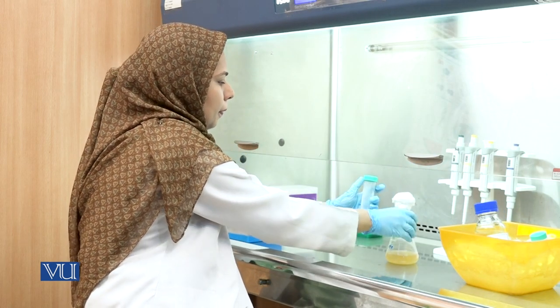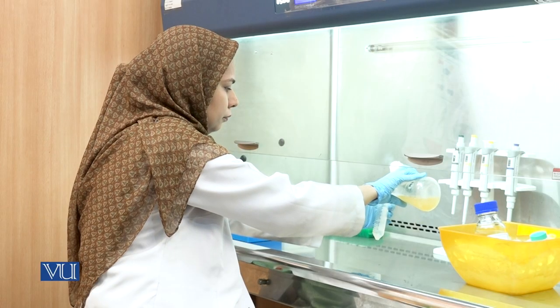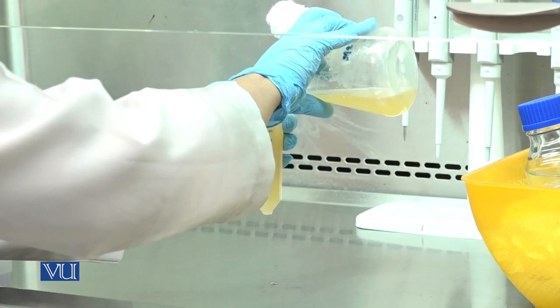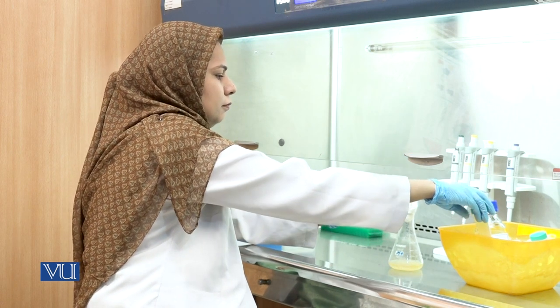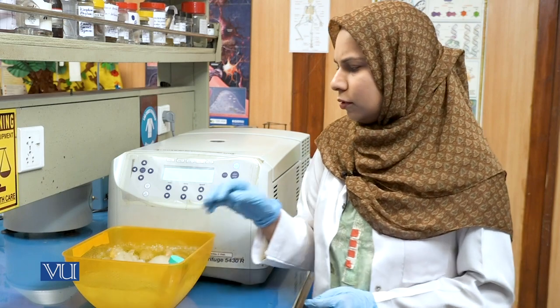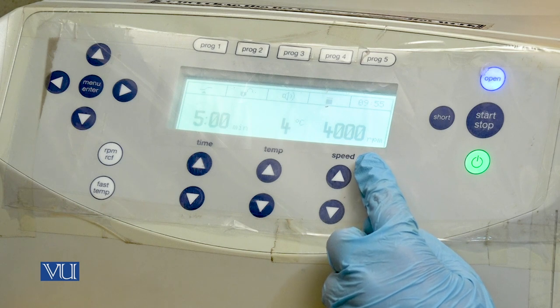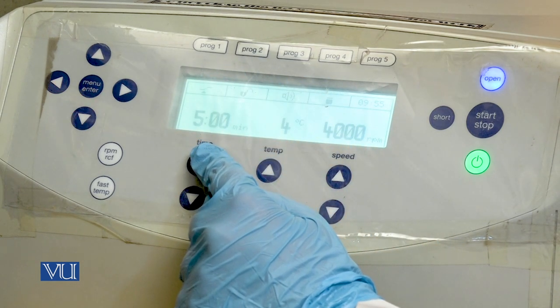For this, first we transfer the culture from a flask into the centrifuge tubes and then put it into the centrifuge machine. After transfer of culture to the centrifuge tube, we need to centrifuge the culture. Centrifugation speed is 3000 g, which is equivalent to 4000 RPM for this machine. Temperature 4 degrees centigrade, and the time for spin is 5 minutes.